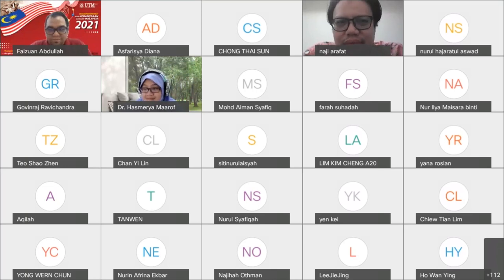Ya, boleh tak? Kita nak kena make sure nikel ataupun any metal dalam sampel tu dalam keadaan free ion. Kita nak pisahkan dia. That's why kita kena ionisekan dia. So that's why you bagi acid. Tengah berkumpul ramai-ramai kan. Tak ada social distancing tu. Kita masukkan nitric acid supaya ada social distancing.